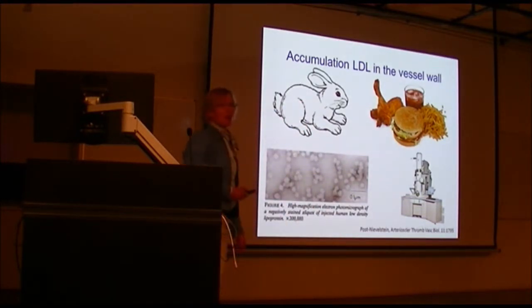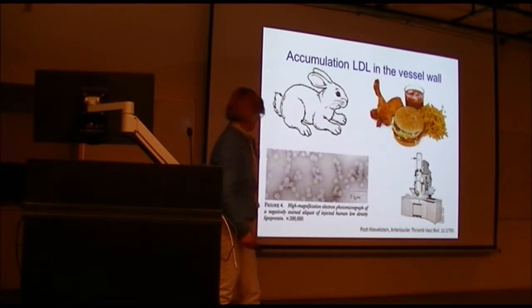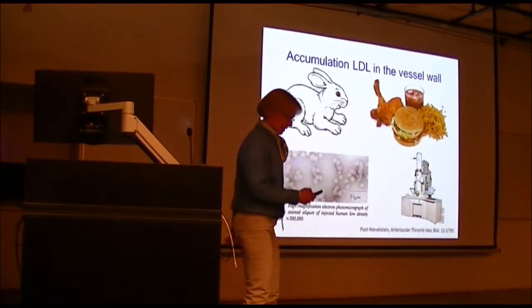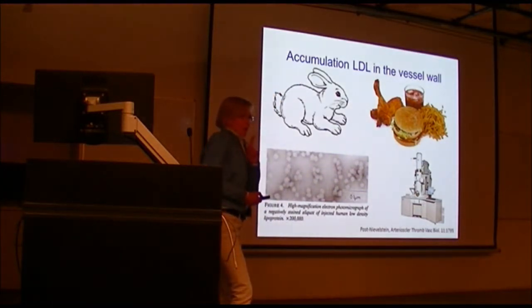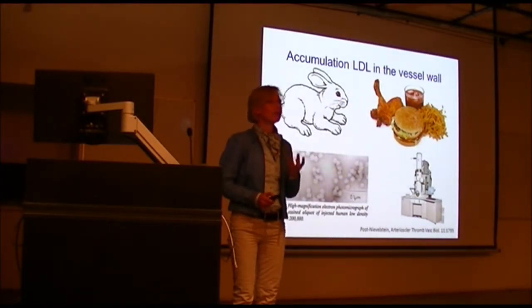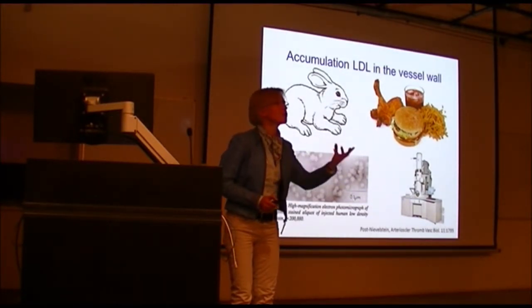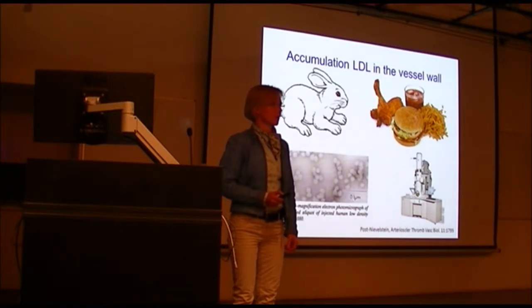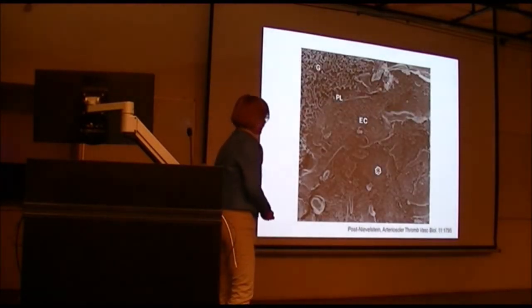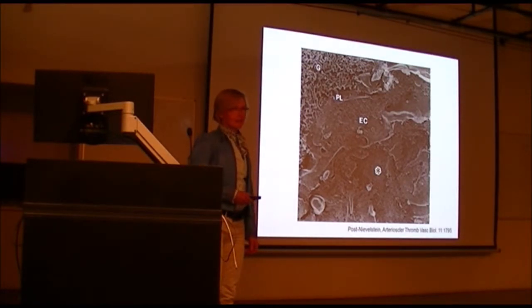And then you look at what happens. And you study it down with an electron microscope. Now here we have purified LDL, these little droplets over there. Here it happens to be human, but the rabbit looks exactly the same. What happens if you infuse a rabbit with a high dose of LDL and you look after 2 hours, what happens to the vessel wall of this rabbit? Now, okay, I think this needs a little bit of explanation.